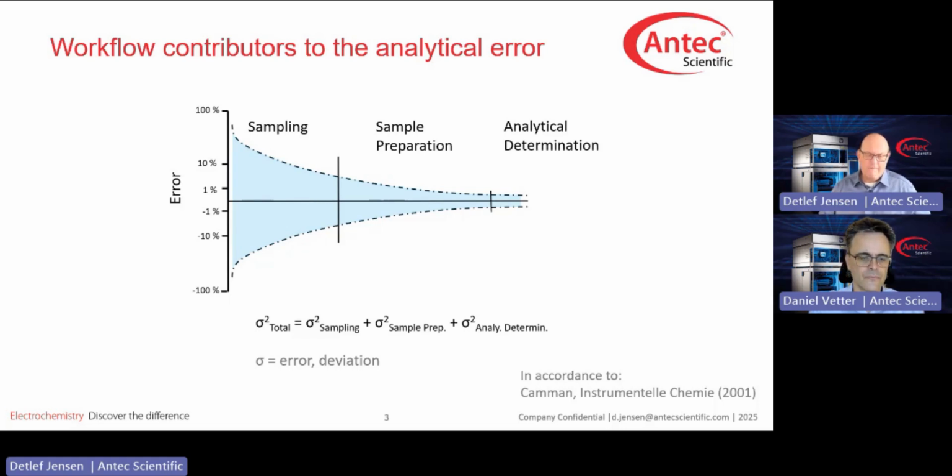The people have different education, very dedicated to sampling, because if you make a mistake in taking the sample, it impairs basically the entire analytical flow path and the analytical result. So it's a huge impact.